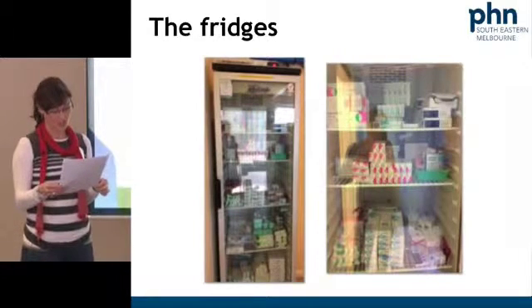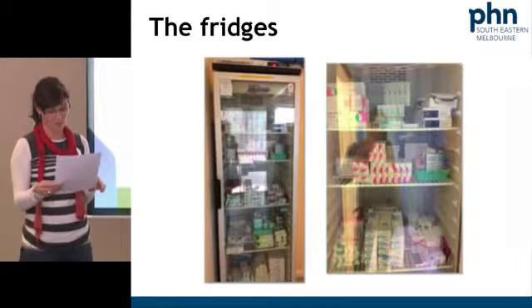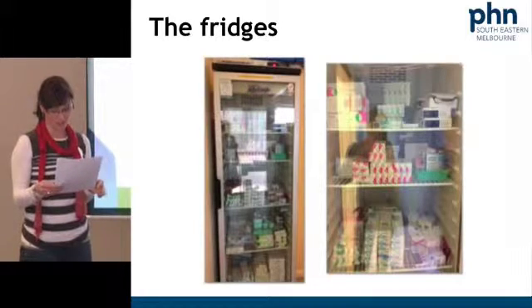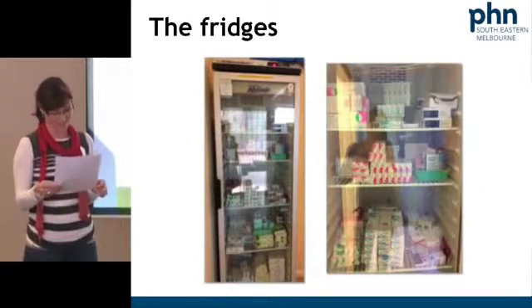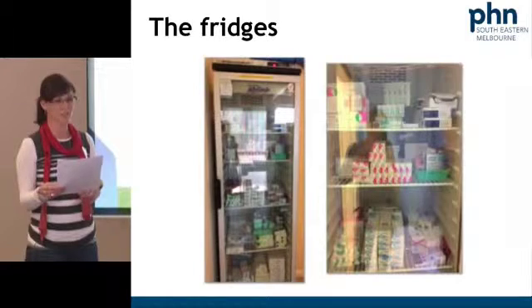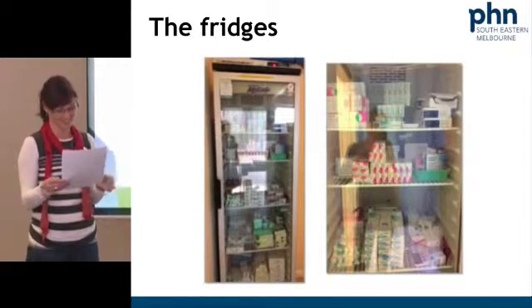Fridge 2 read a minimum and maximum respectively of 1.3 to 6.7. Therefore, the lower range was out of control. They are saying that the controller cannot be calibrated properly to keep the vaccines at the temperature they're meant to be stored at. They also said that the minimum maximum display cannot be calibrated at all, and therefore there is no provision for it, which I'll go into because there's a bit of contradiction from last year.